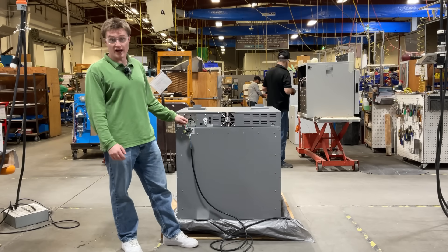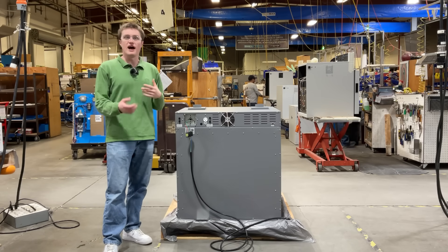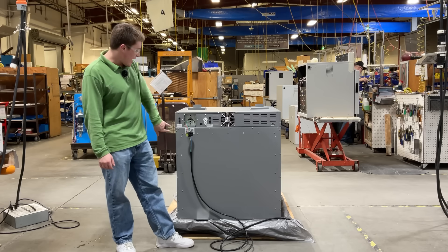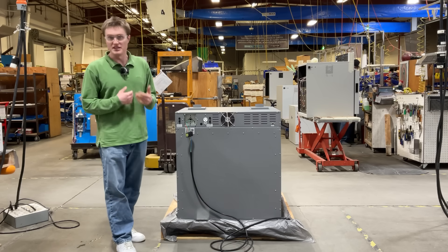The convenience outlet is linked to the hardwired connection and allows you to power any auxiliary devices you want located around your unit. Both the auxiliary outlet and the main electrical inlet have two externally located fuse holders to make replacement of fuses easy for the user.